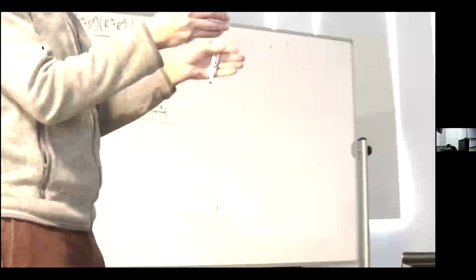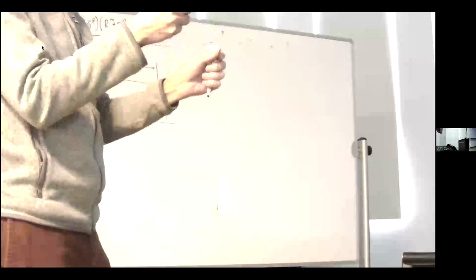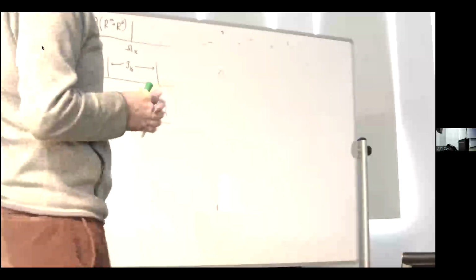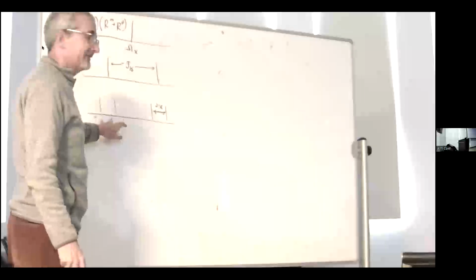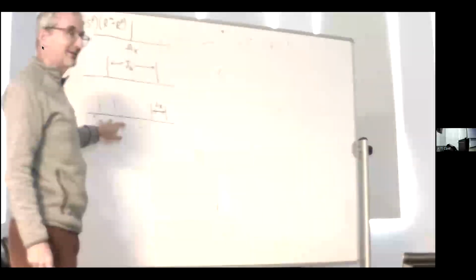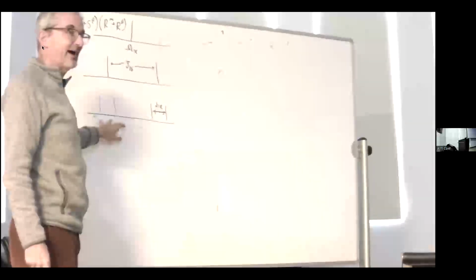And because I started with the large coupling, I don't have the problem of figuring out which lines cross each other, which can be confusing. Now, each of these lines I can label with the state of the S and R, right?